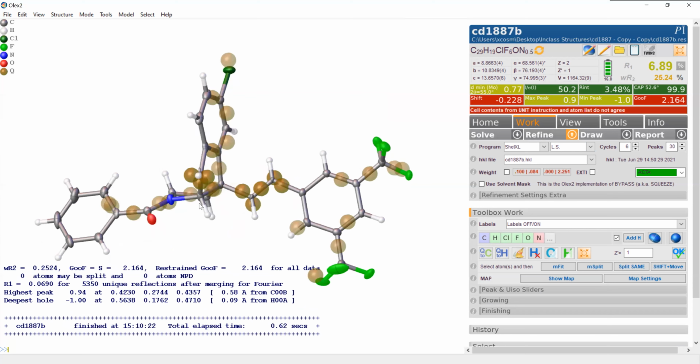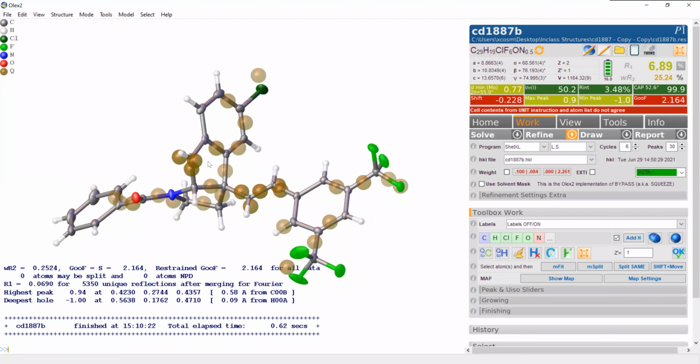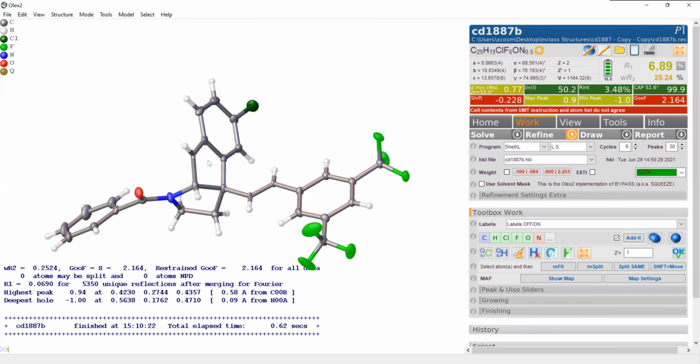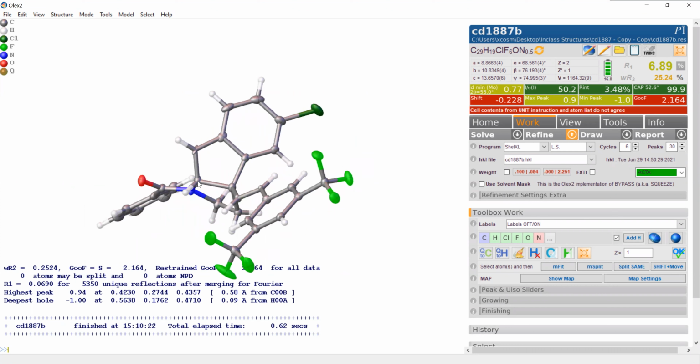And you see now the thermal ellipsoid looks similar in size to its neighboring atom types. So now if we look at any other atom positions, are there any thermal ellipsoids that don't look right? So we checked this one out. This one was correct. It's about 0.018, 0.012, 0.019.